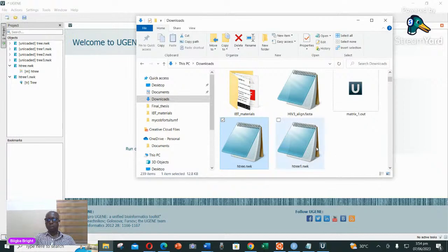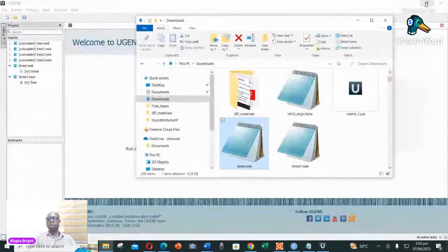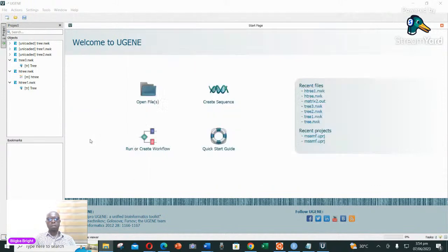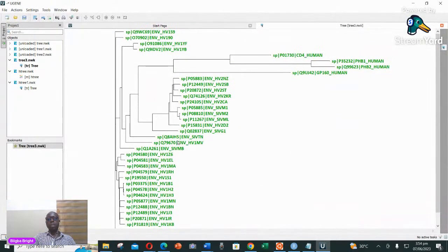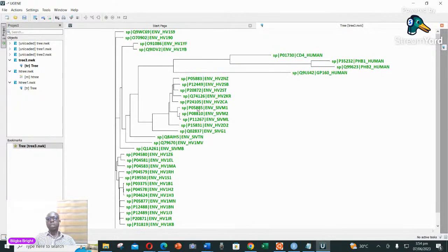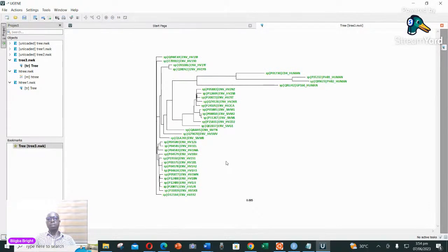Okay, so there is. Let me open this wide and see. Okay, so there's one here. I could actually check for that one and see how that will look like. Let me reduce the size and then pick a different tree, and then you see what maybe you will see. Okay, so now this is a different tree that I generated earlier. So you can actually see how the clustering is done. So let me come here and click, and then you see how it is being done.